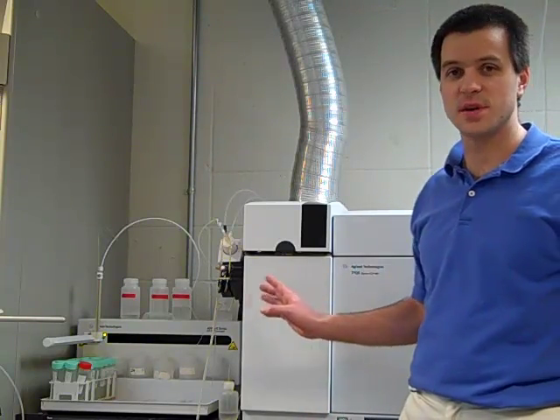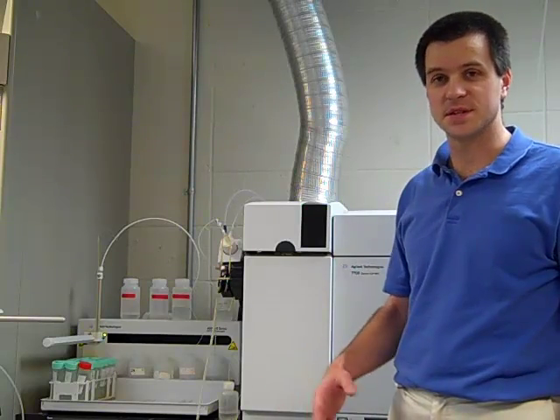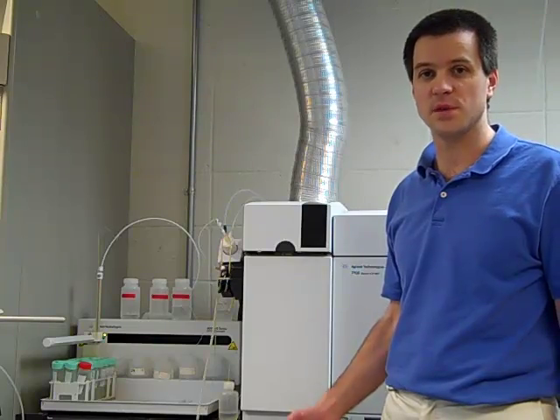This is one of our most recent instrument acquisitions, funded by a research grant from the National Science Foundation. And this instrument is used heavily both in environmental chemistry courses and research, as well as geology coursework and research projects.